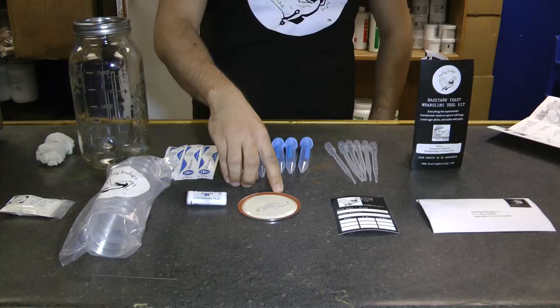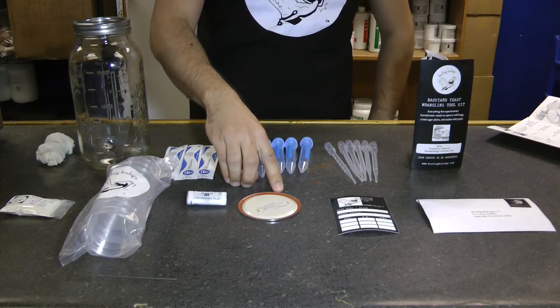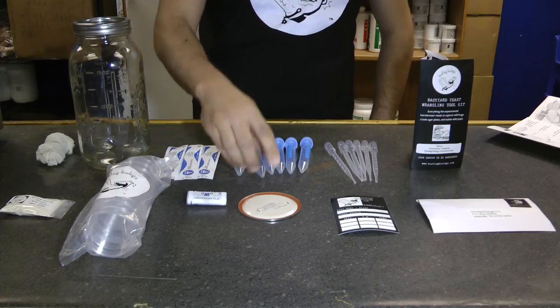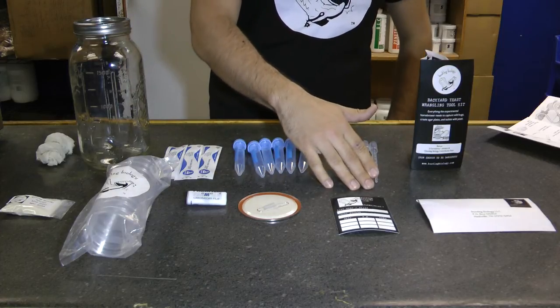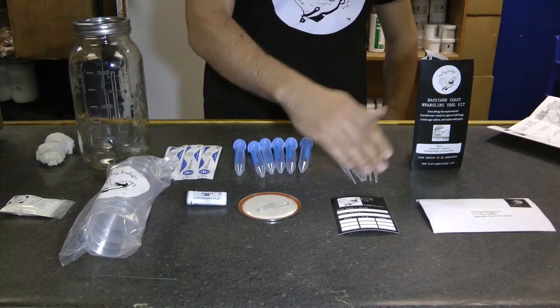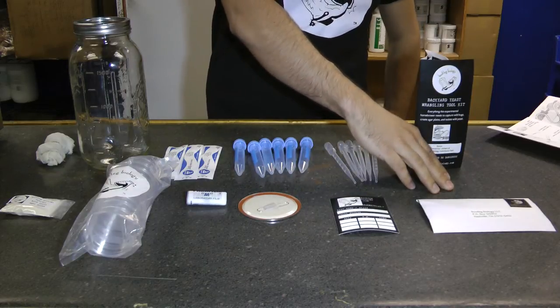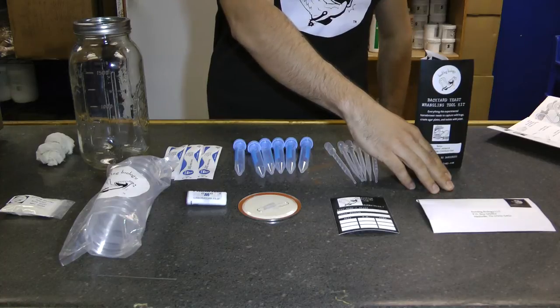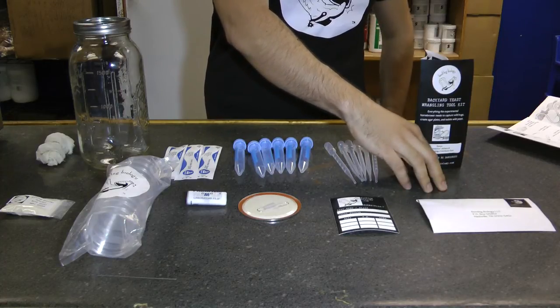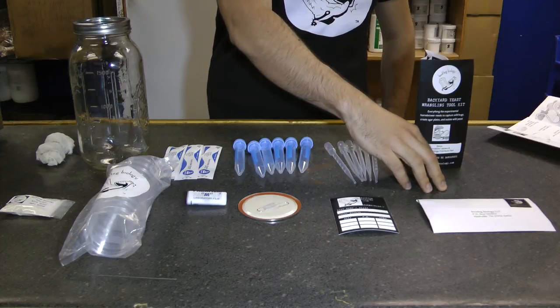Also included here is a paper clip. You're going to streak yeast onto the agar plates, and then you'll get a colony that you can isolate. Additionally, there are some fermetric stickers, which are a great way to track your fermentation, and then a Bootleg Biology contributor pack. So once you've gone through the process of isolating yeast, put a sample in the letter, send it off to us, and we'll add it to the yeast bank.